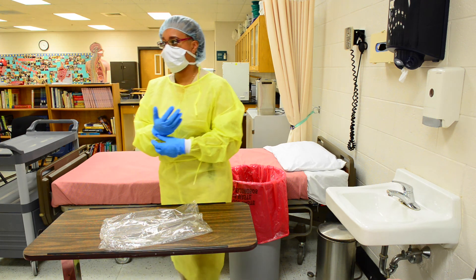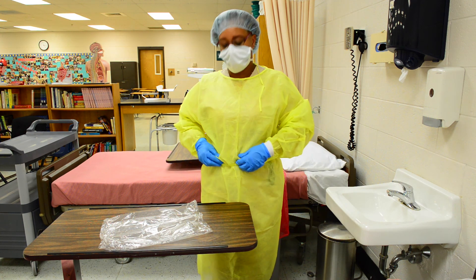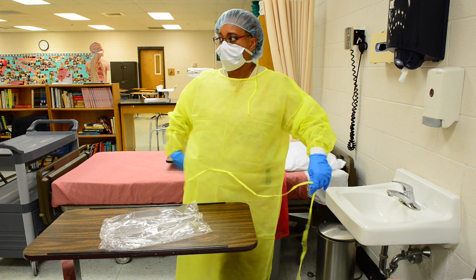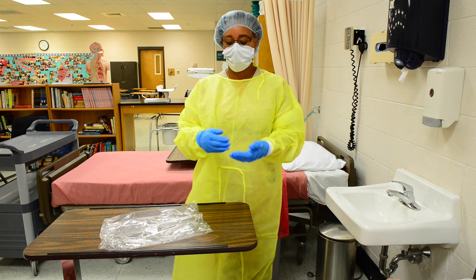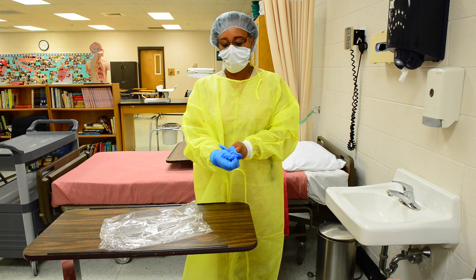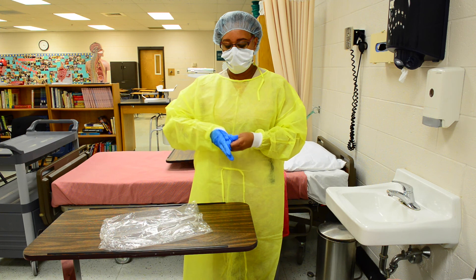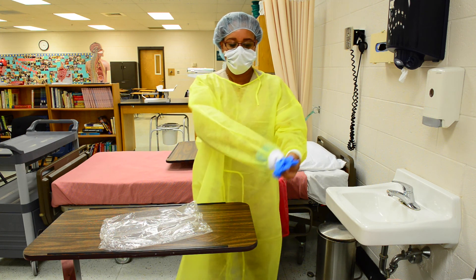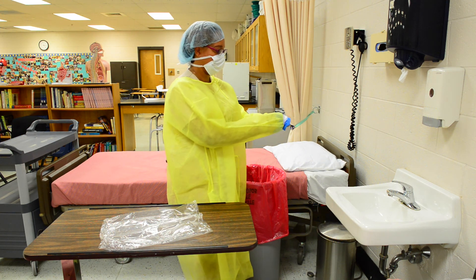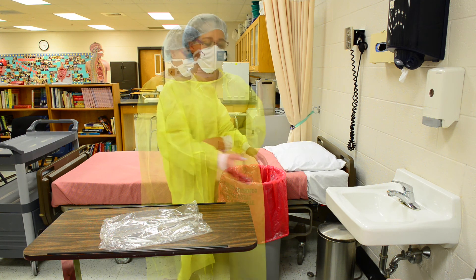Now we will remove the garments. Untie the waist ties of the gown first. Remove the glove using the gloved hand to grasp outside of the opposite glove. Pull the glove off inside out and put the ungloved hand under the glove to remove the second glove. Place in the infectious waste container.